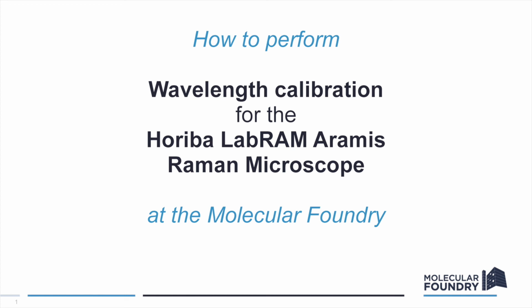In general, the microscope tends to keep its calibration within a couple of wave numbers over the course of weeks, but if you're trying to get reliable data for a publication or to compare across the weeks, then you want to calibrate before doing any kind of measurement.